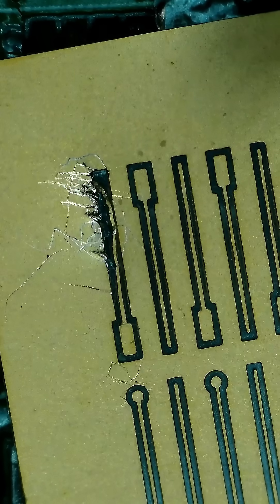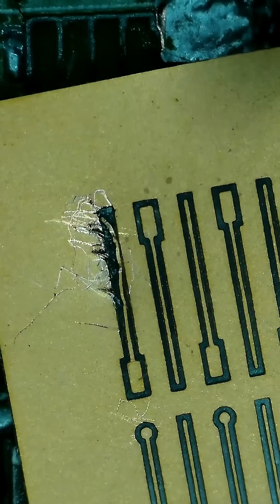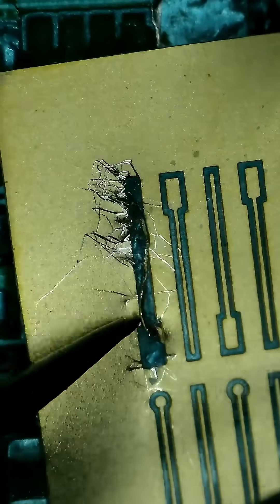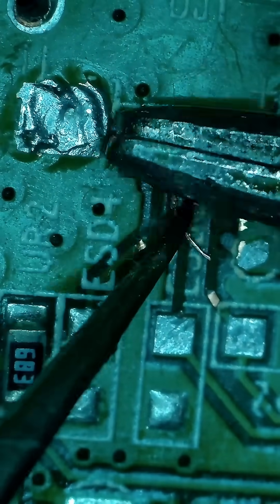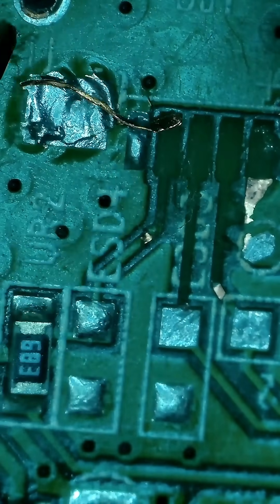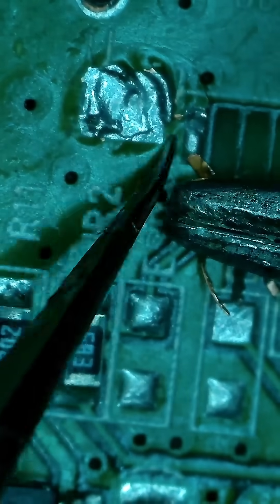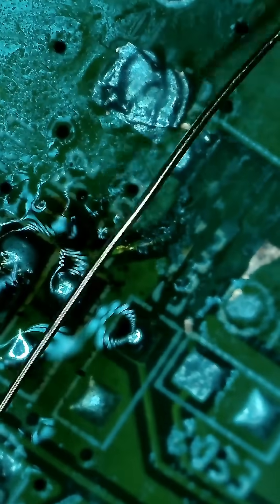I then tried to use these pads to rebuild the traces, but that turned out to be a huge hassle. I think I need better tweezers. Moving on — I soldered some new traces using enameled wire.